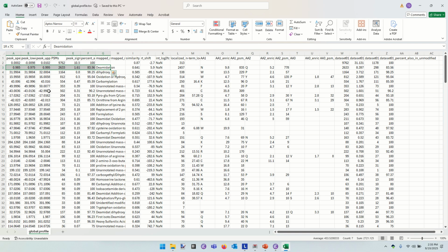Let's get some hints on how this could happen. We come over here and see that there's not much sighting of that at the N-terminus of the peptide. So we're not gaining 1 Dalton on the N-terminus. That's not common here. The most prominent amino acid in which this happens is asparagine. It's enriched many-fold past what you would see by random effect. And the second most common place we see it is in glutamine. Are we any closer to guessing why we would gain a Dalton here? Protonation on the acid groups. No. This is bog standard deamidation.